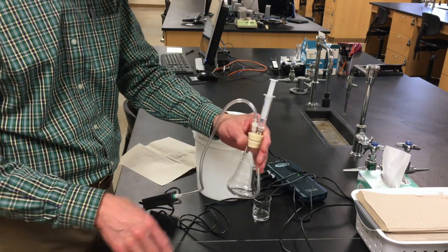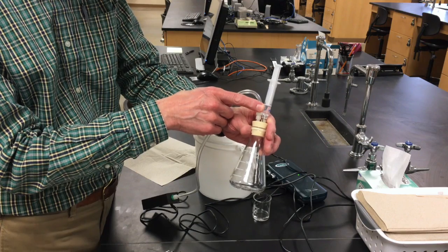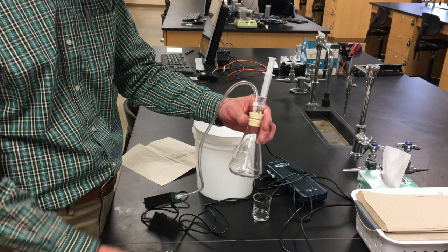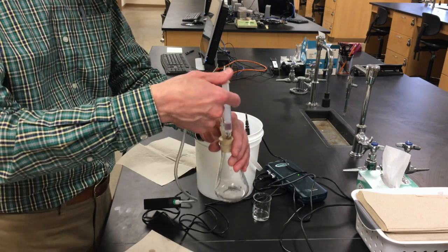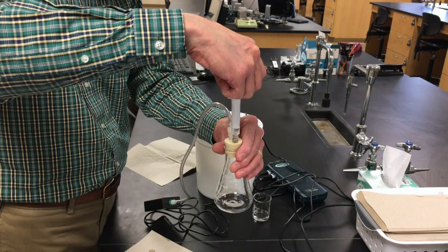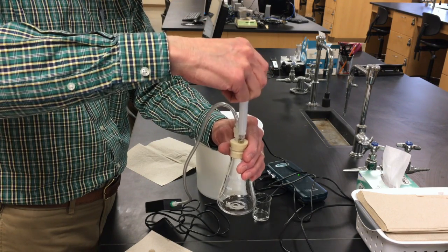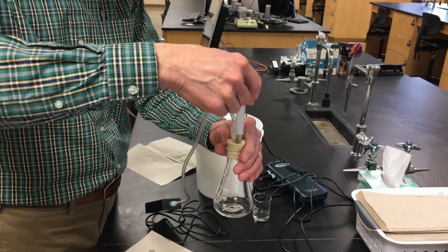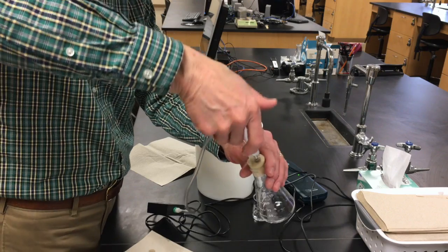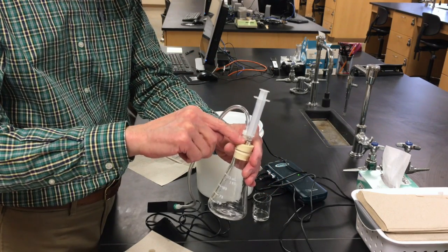Now, we're ready at this point to inject the liquid. If the liquid all stays up in the syringe, it won't evaporate as well, and we won't be able to measure its pressure easily. So we're going to squeeze that, and then maybe go in and out a few times to make sure that all the liquid gets in there. But be very careful when you're doing this plunging that you're not twisting the syringe and causing it to loosen at all and break this seal.